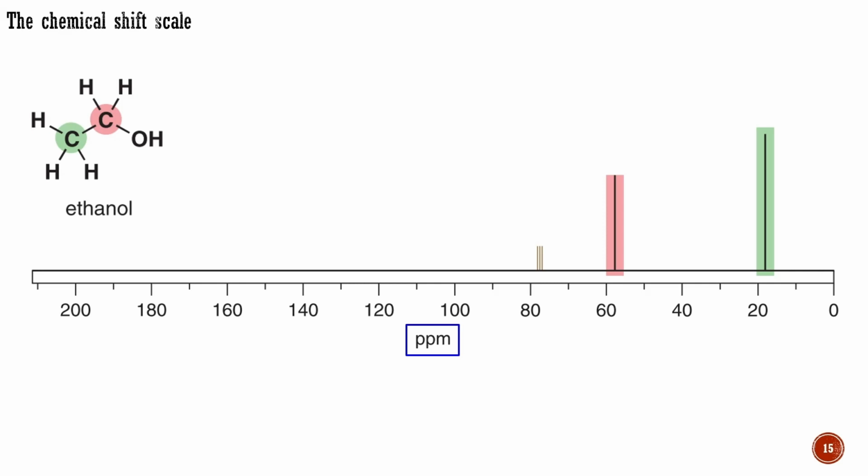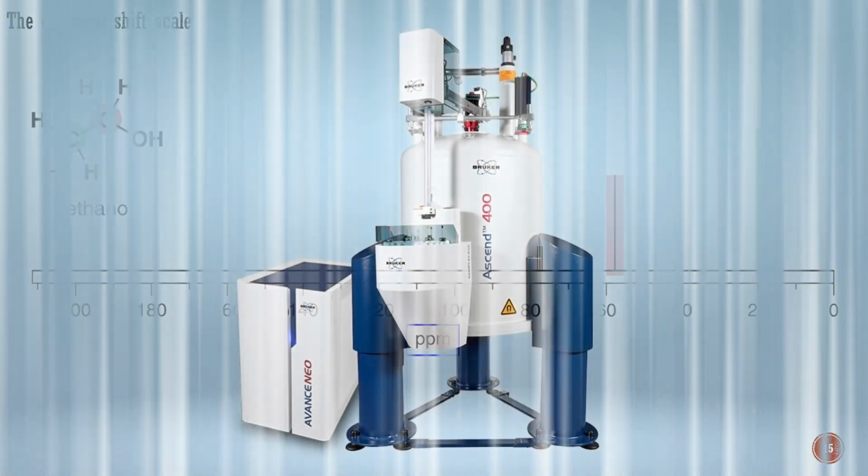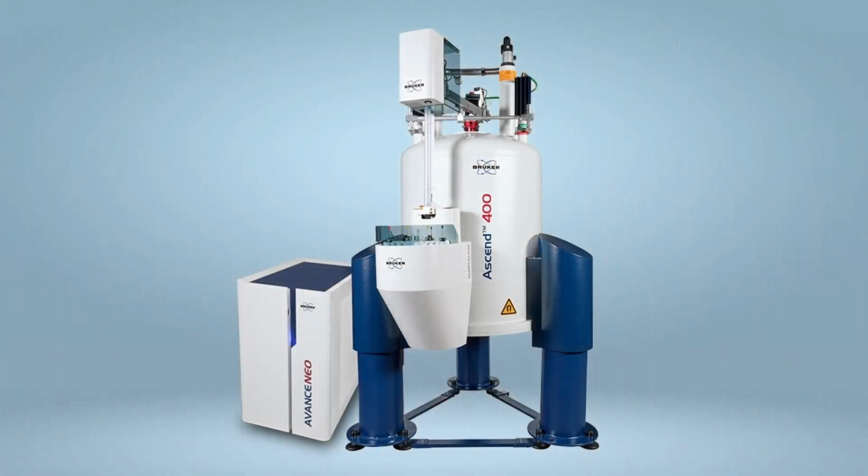We know that all protons resonate at approximately the same frequency in a given magnetic field, and that the exact frequency depends on what sort of chemical environment it is in, which in turn depends on its electrons. This approximate frequency is the operating frequency of the machine and simply depends on the strength of the magnet. The stronger the magnet, the larger the operating frequency. The precise value of the operating frequency is simply the frequency at which a standard reference sample resonates.